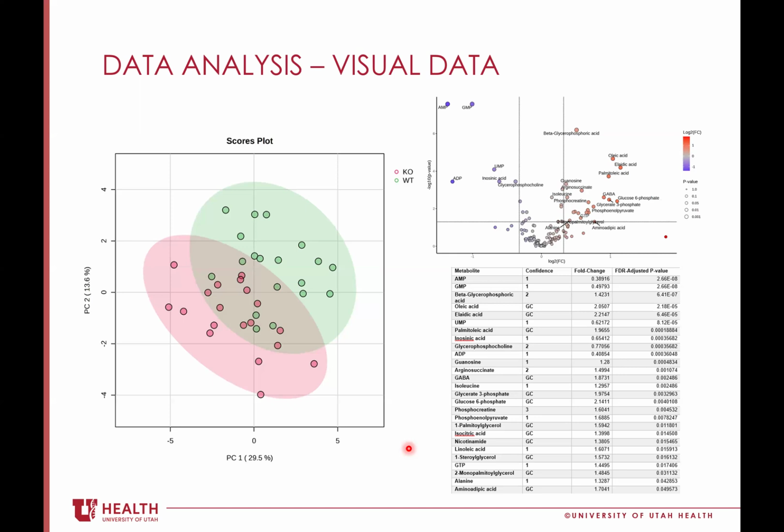The best way to do that would be Metabolomics Workbench, because that's got a great amount of data already there that's really well annotated. The problem we would have is, one, we'd have to ask the PIs, can we share the data? And two, we'd have to put all that together, which would be an incredible amount of time. But if you wanted to take that approach, which is a really cool idea, MetaboAnalyst is where I'd first start looking.